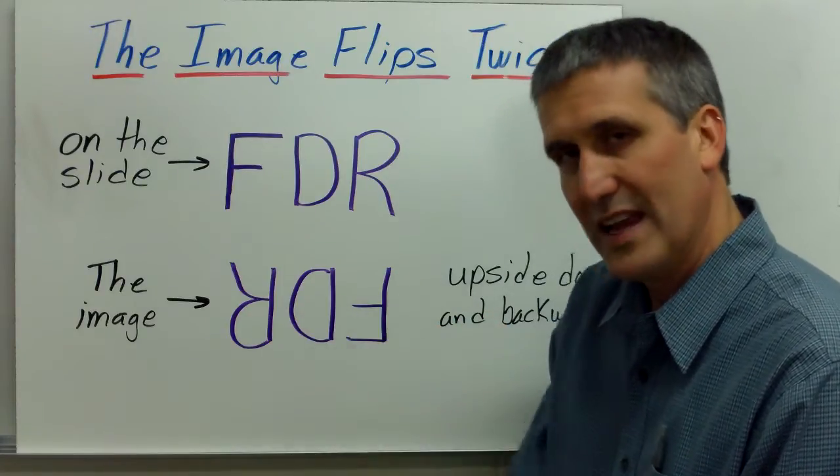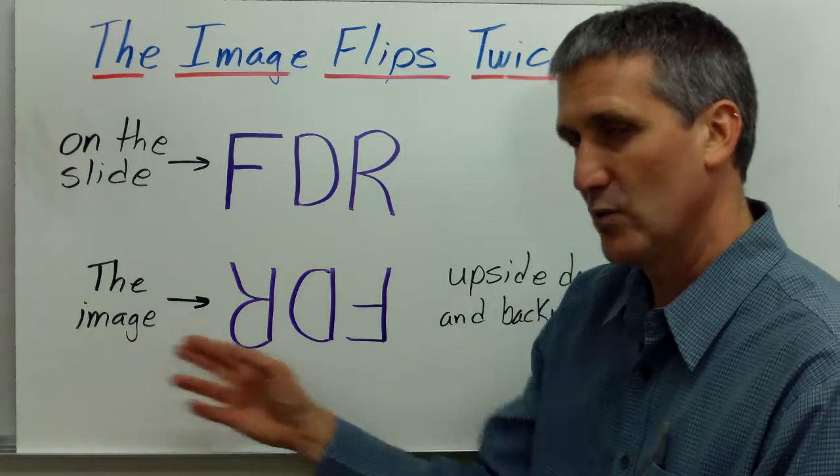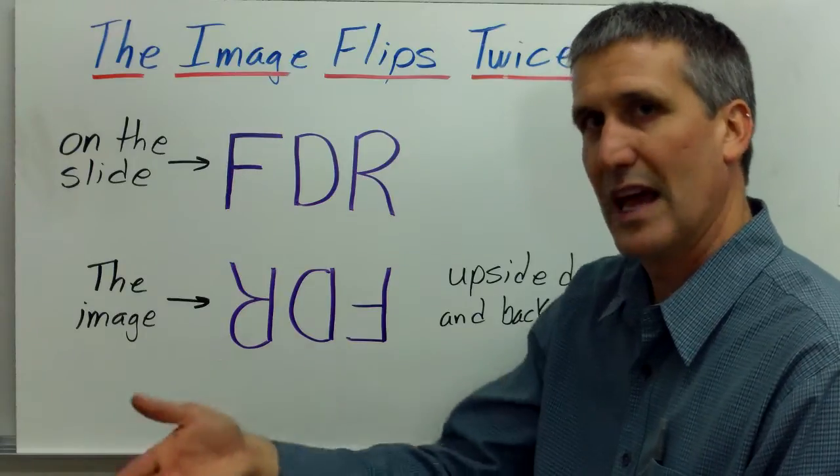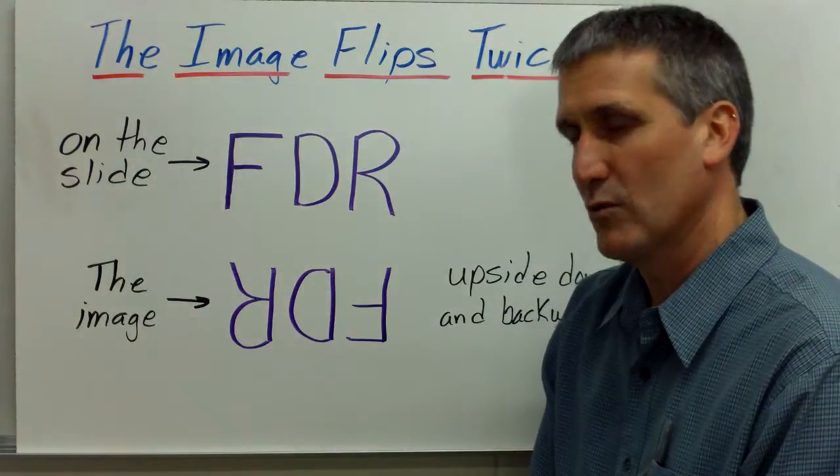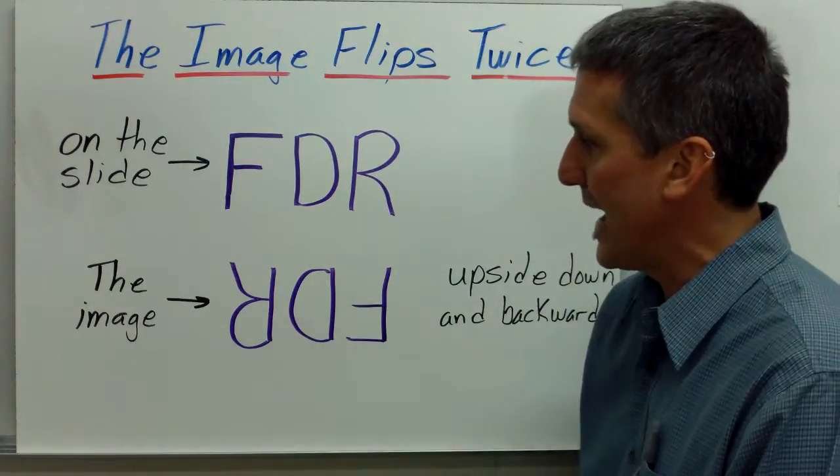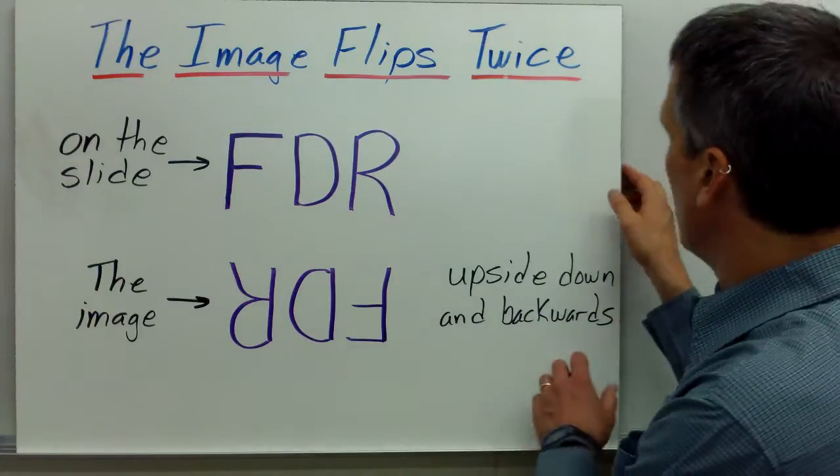and then you look through the eyepiece of the microscope, the actual image that you will see will look like this. It will have flipped upside down, and then flipped again, so it will appear backwards. So, it appears upside down and backwards. So, remember that.